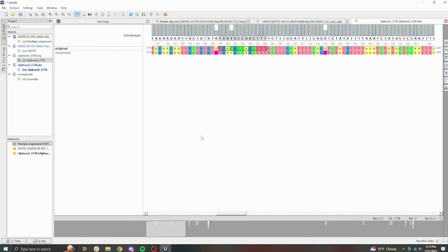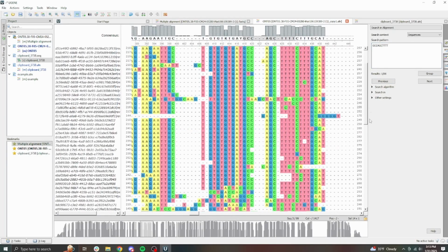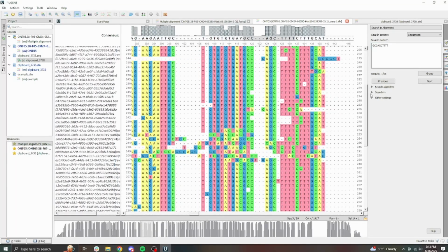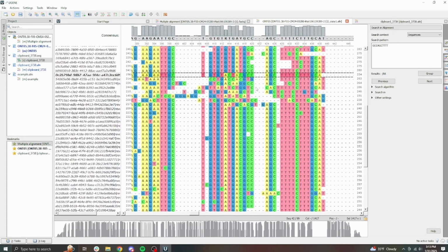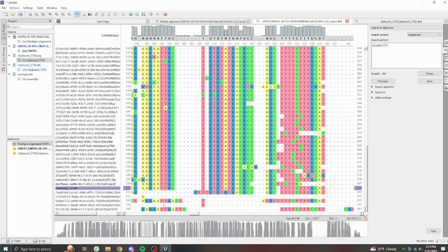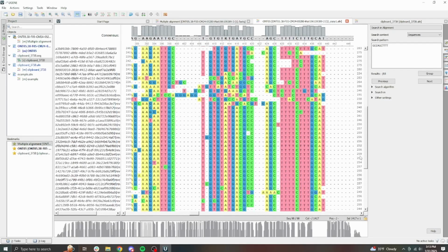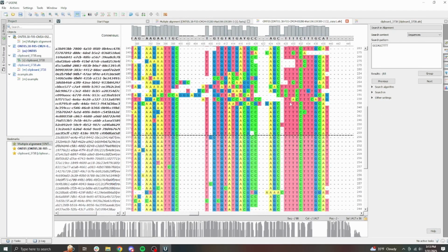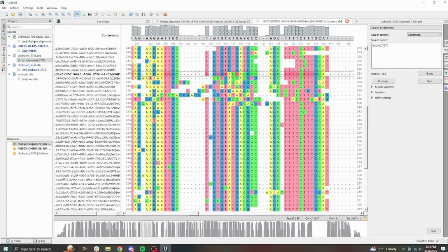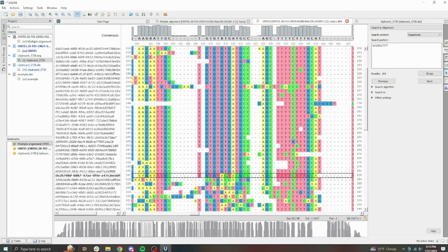Don't do that. So let's try this again. Alrighty. So we got my Y's, my R's. Yeah. So that looks a lot cleaner. It's still not perfect, but I'm not concerned overly much with a couple aberrant reads because it should balance out, right? We're working off averages here. We're not working off of every read being perfect. This is why Nanopore works, because it works off of averages.